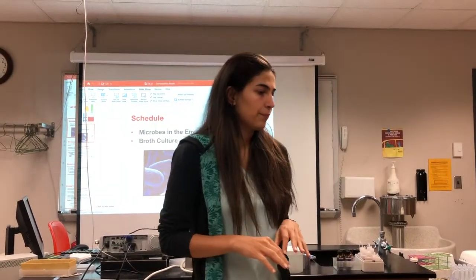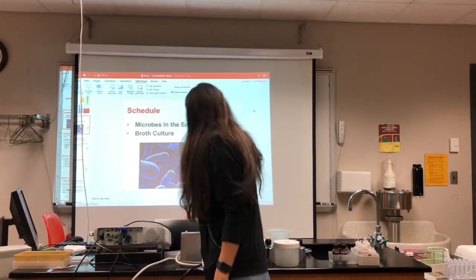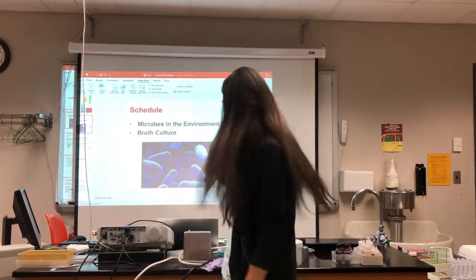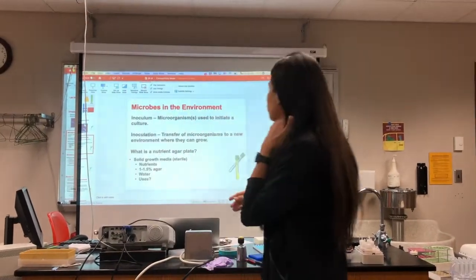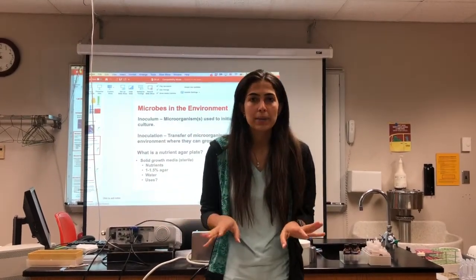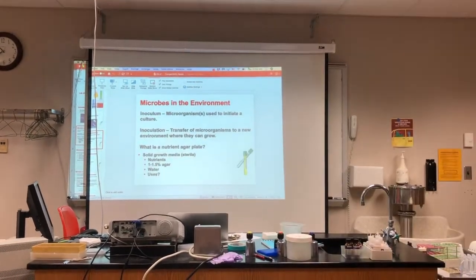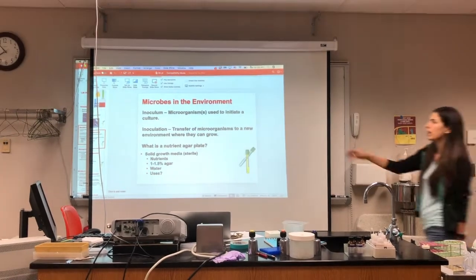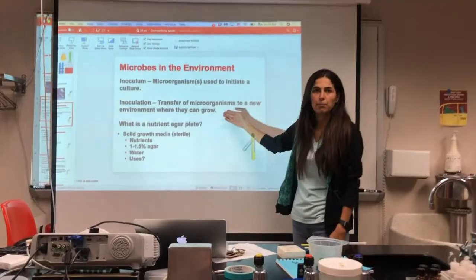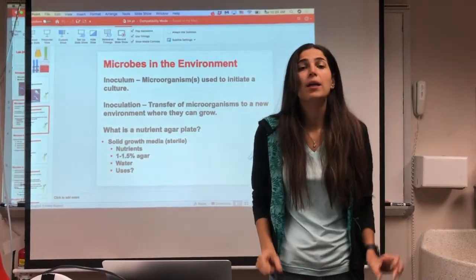Today is the first session after the orientation, where I'm going to talk about microbes in the environment and also broth cultures. Before we go to the experiment, you have to know what the inoculum is and what the inoculation is. The inoculum is the microorganism which we use to initiate a culture, and the inoculation is when we transfer the microorganism to a new environment where they can grow. We call this term inoculation.